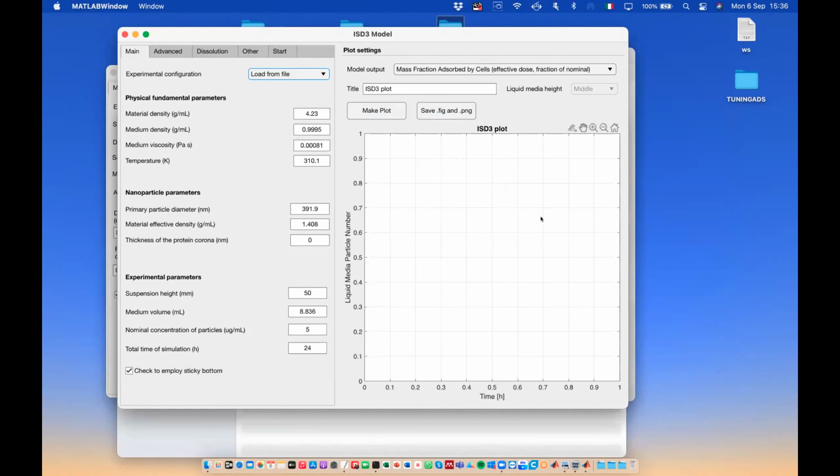For example, for our evaluation that we will see in the last presentation of the day, we used all nanoparticles from JRC benchmark, and basically we can refer to those data sets, to those databases for the physicochemical properties of nanoparticles to feed to DosiGUI for starting simulations.